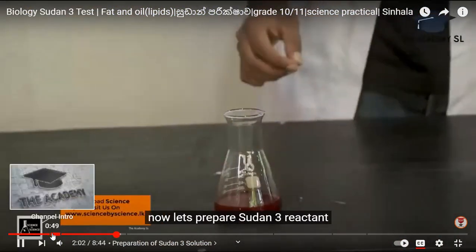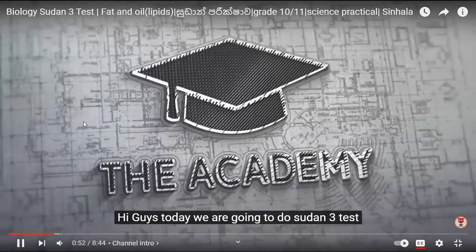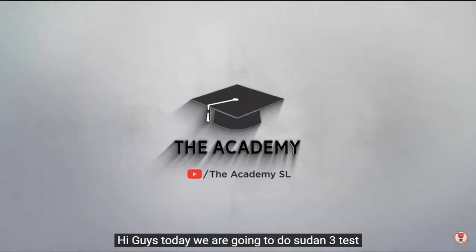He is showing you from the beginning how to prepare the Sudan 3 and how to do this experiment.